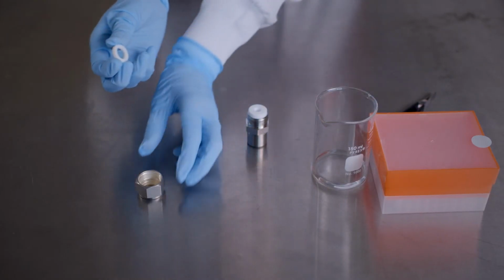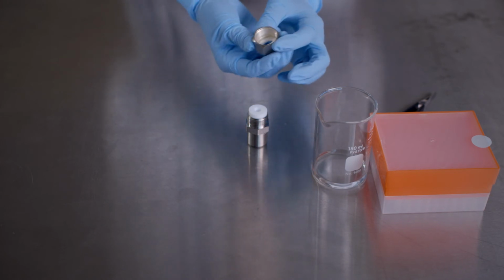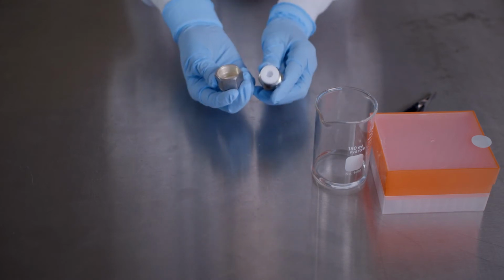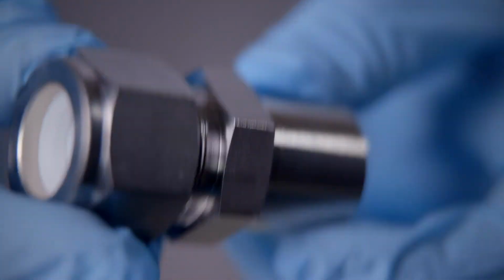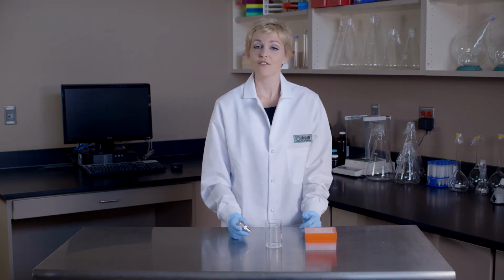We add our Teflon bearing to our retainer nut, and finally, add the retainer nut to the threaded end of the extruder outer casing and hand tighten until finger tight. No need to use a wrench. Now our extruder is fully assembled and we're ready to make our liposomes. For any additional questions on extruder assembly, email us at technical@avantilipids.com.